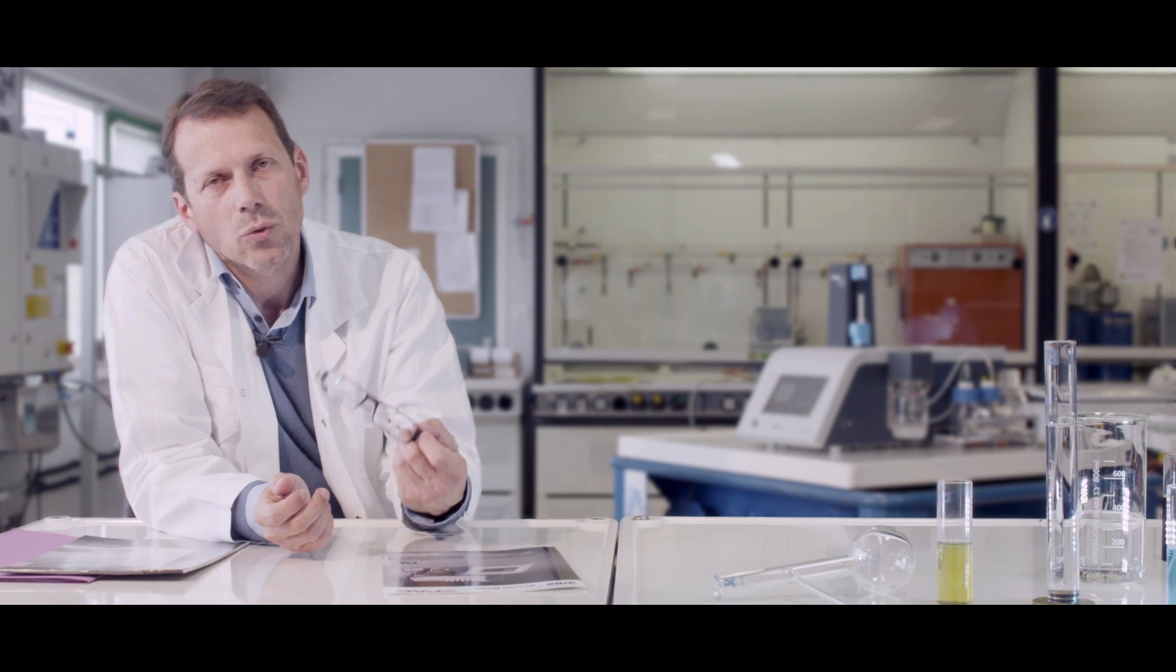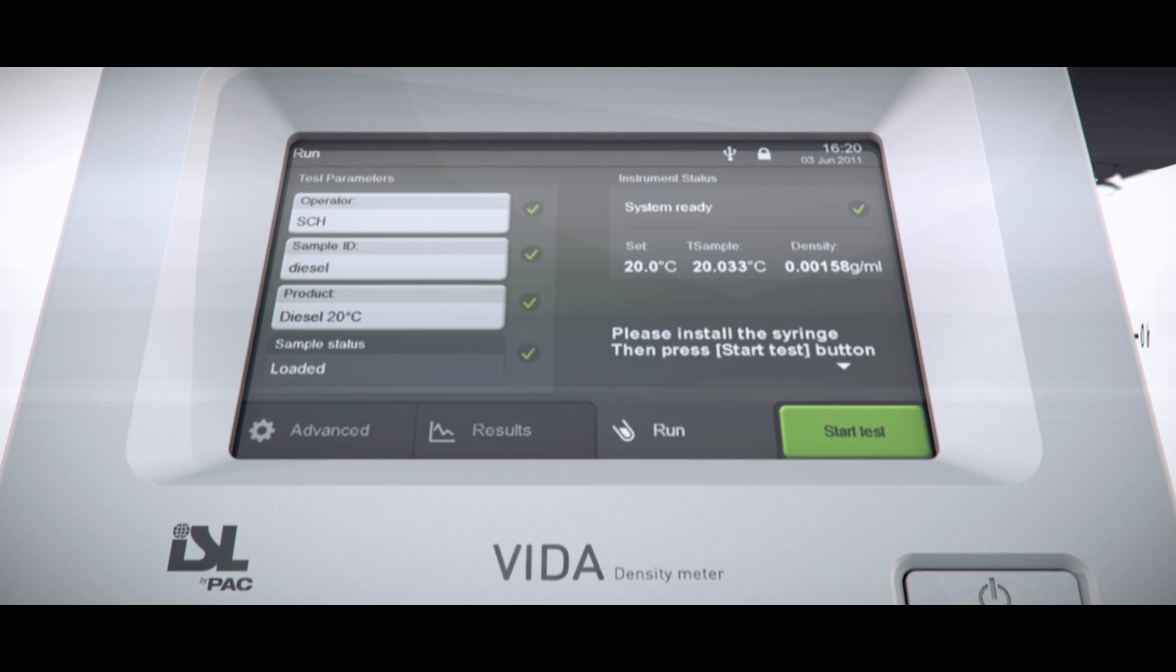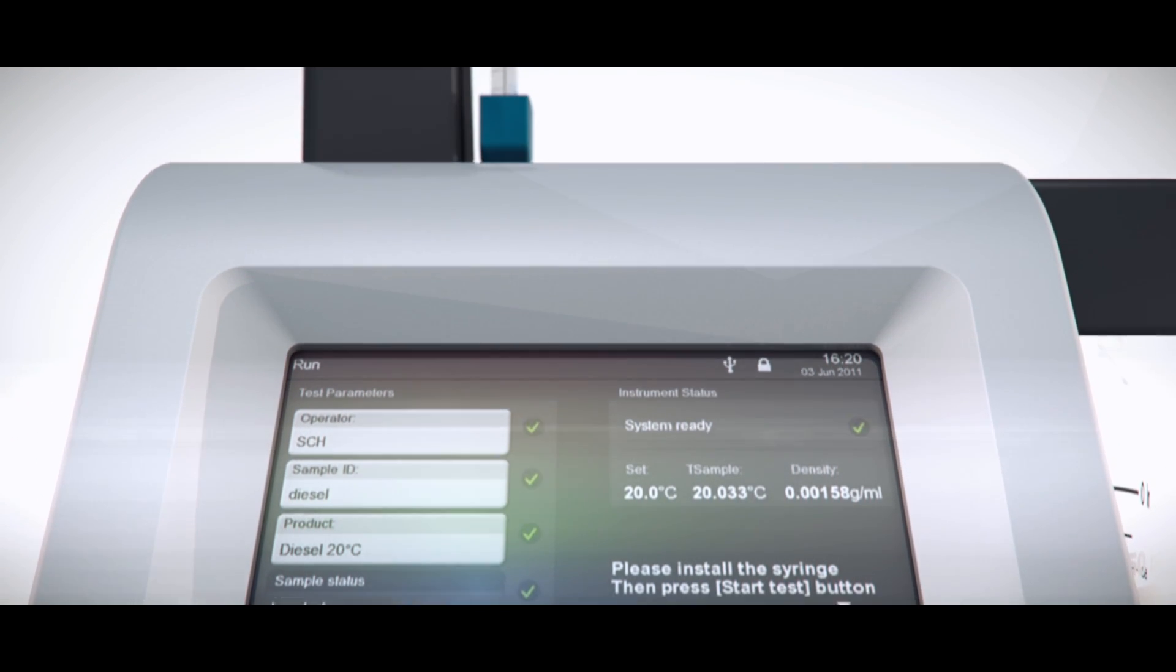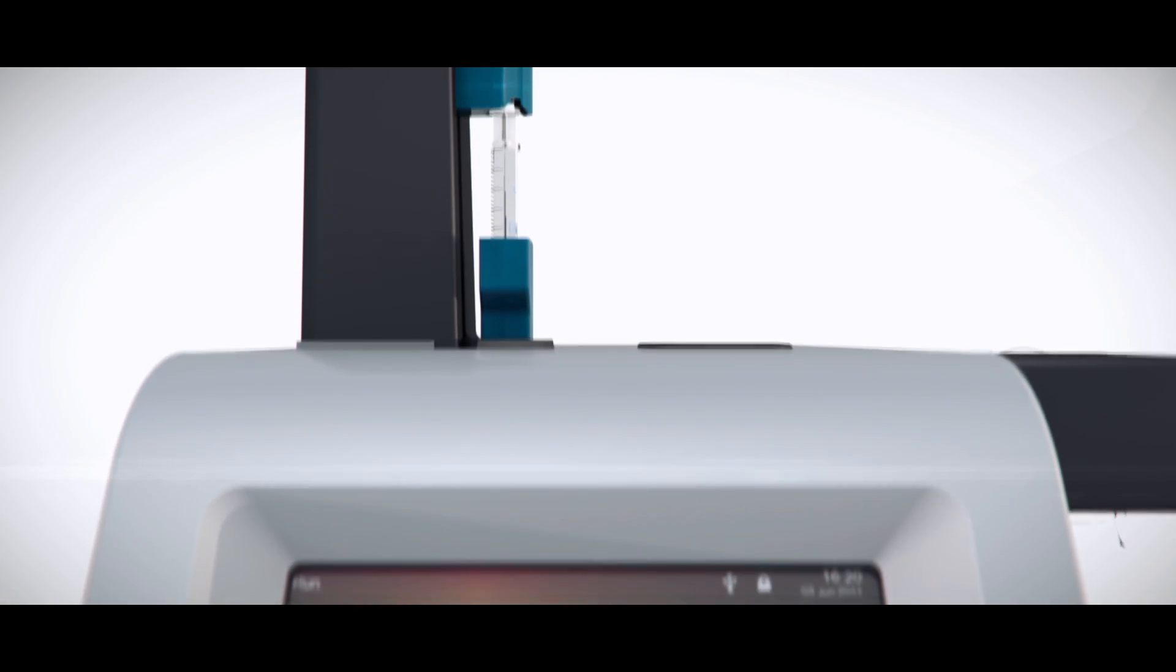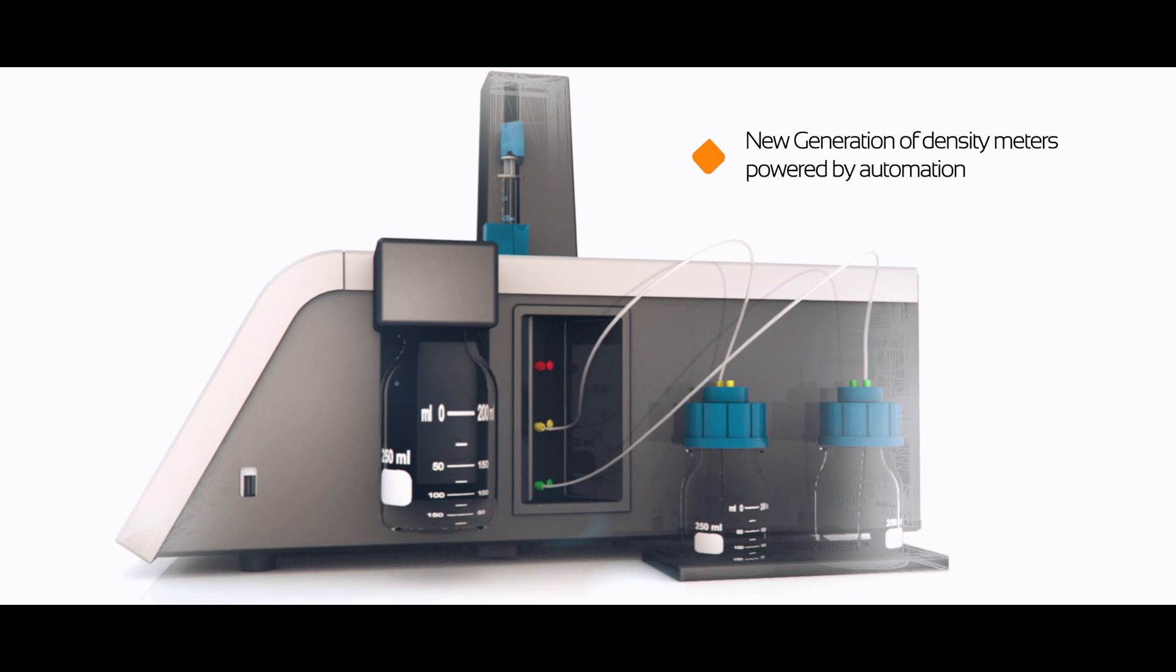When you think about density, this is a characteristic very simple to measure, yet critical in our industry, oil and gas, as it determines the type and quality grades of petroleum and products. Therefore, we use digital density meters based on oscillating tube technology to achieve the highest precise and reliable measurement.